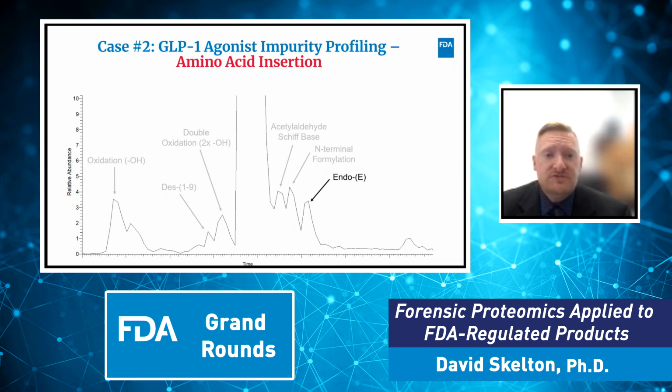We also observed additional amino acids being inserted into the sequence for the GLP-1. So Endo-E is proteomic nomenclature to indicate that an additional glutamate was added into the sequence. And we identified aggregates of the GLP-1 agonist here as a dimer.